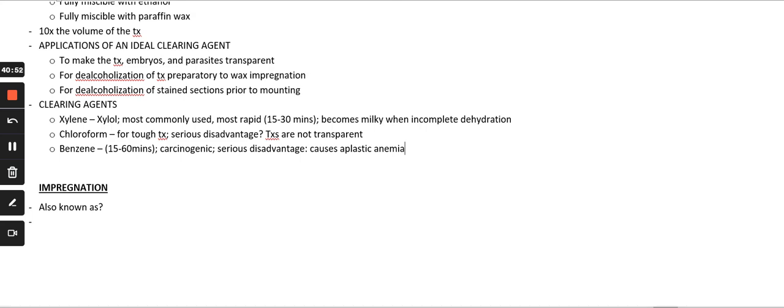Last one, unsa pa may line? Aniline. Nakachika mo ka ng aniline, di ba? Katong clearing embryos, insects, and very delicate specimens, si aniline oil. Si clove oil, katong it becomes adulterated, right? It has the tendency to become adulterated. Okay, so I hope you still remember that.